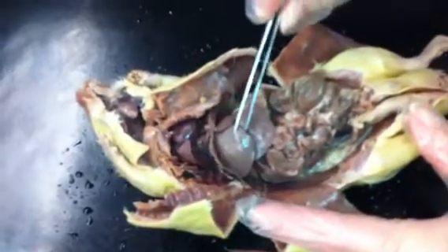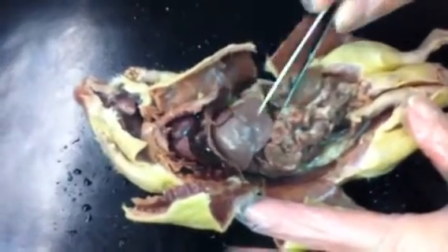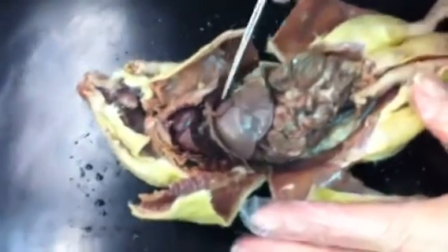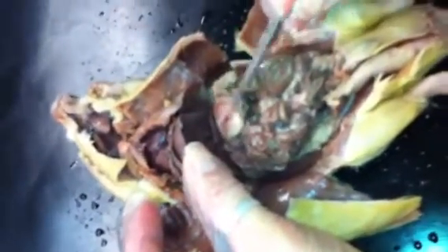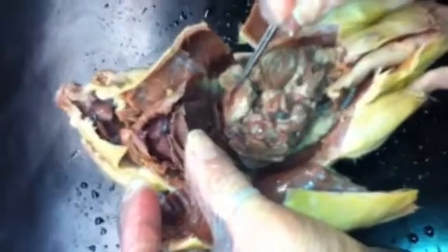So this is the liver. So there's actually several lobes of the liver. So notice that these all look kind of the same. And then if I gently lift the liver up, this pouch-like organ right here is the stomach.